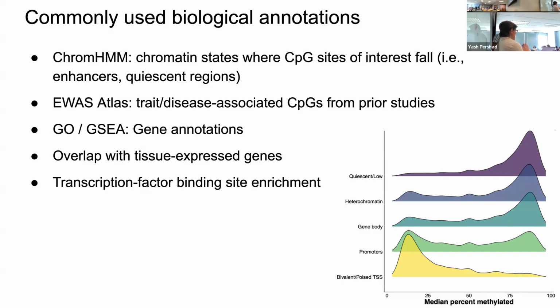The next is gene annotations. So associating your CpG sites of interest or your regions of interest with the nearest gene is one approach. I think there's reasons to put space parameters on that. But a common thing also to do would be to ask from the transcription start site through the end of the gene body, through, I don't know, 10 kb upstream of a gene. You could say, what genes are close to my CpG sites of interest?